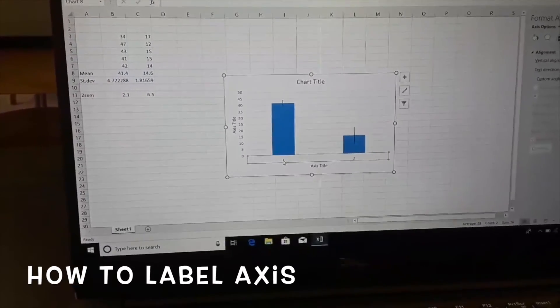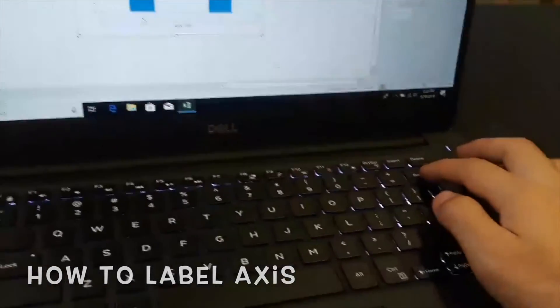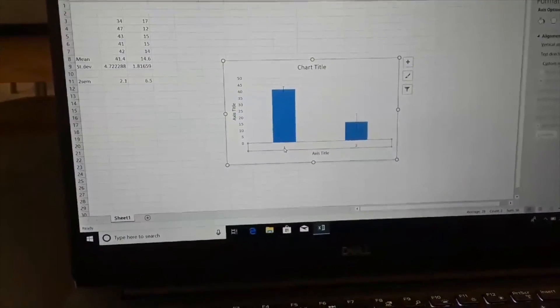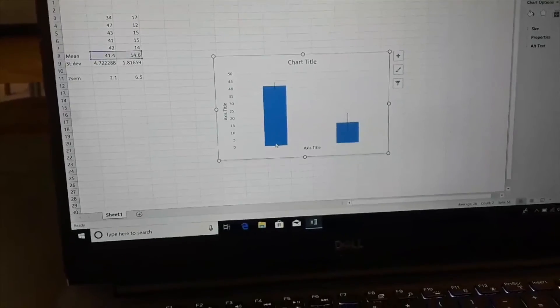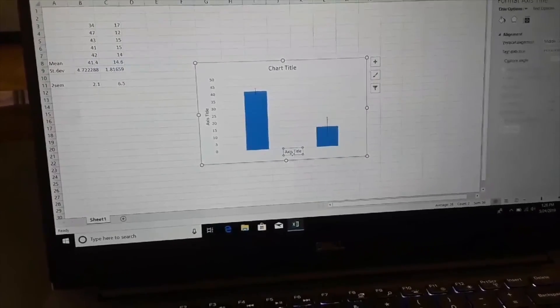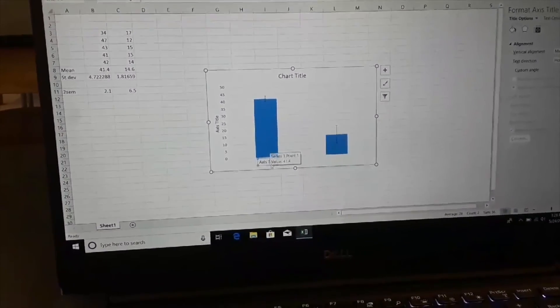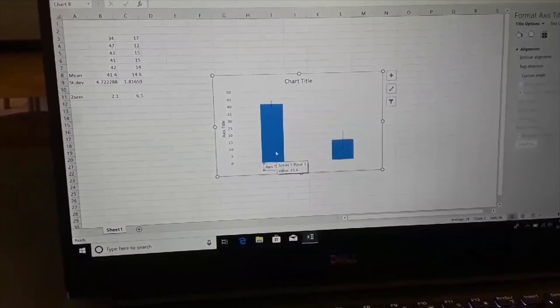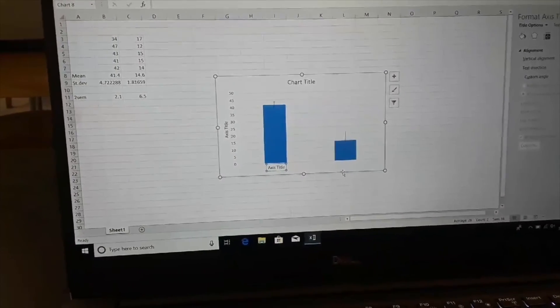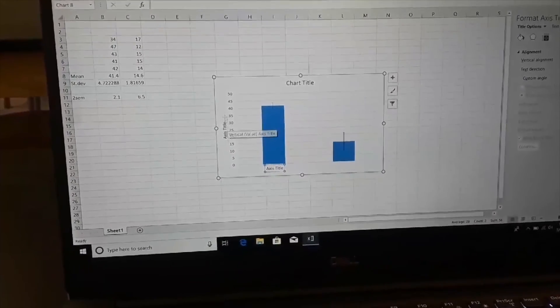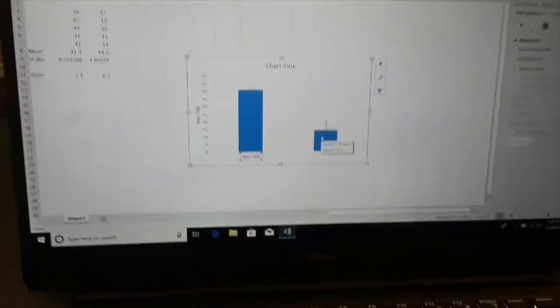To label the axis, just press back. Remember, get rid of the 1 and 2. Get rid of that. And then for this one, I want you to label it. So this one could be like this one right here is the one without soap and the one with soap and the number of drops. And then that's what it should look like.